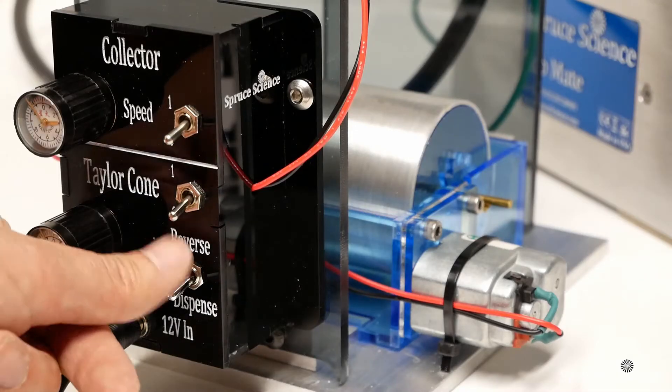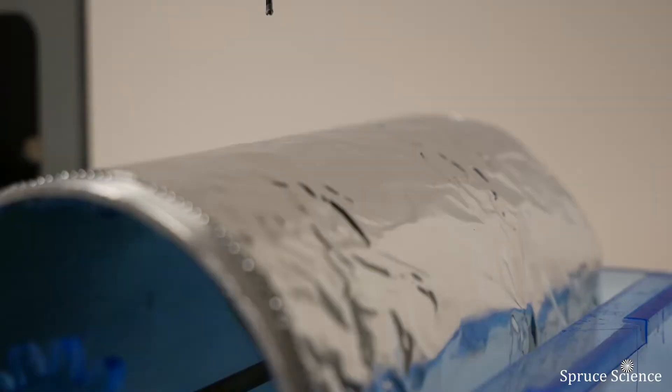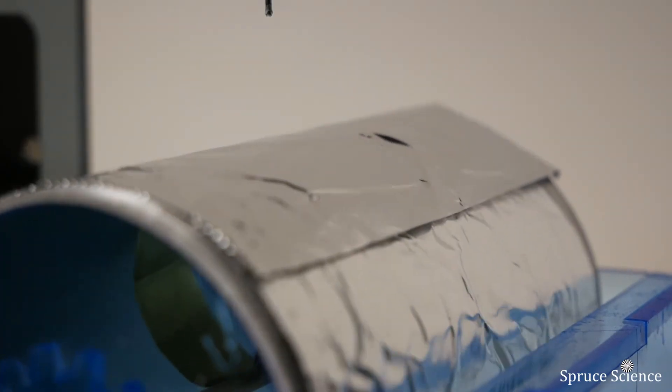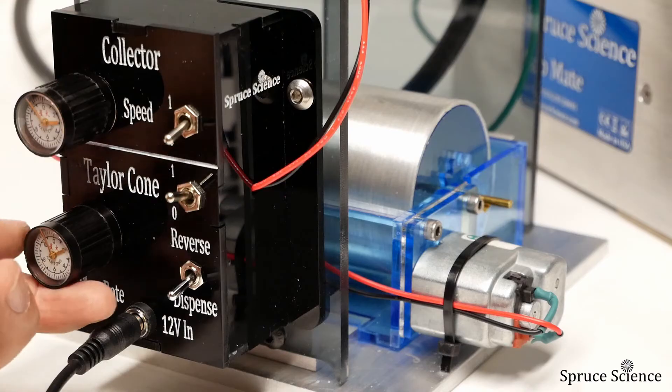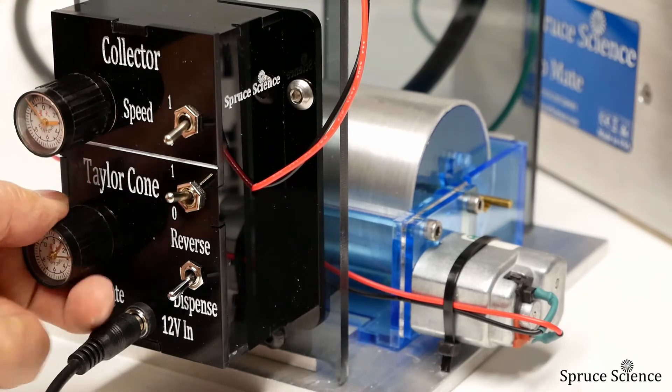Set the pump direction to dispense and turn on the pump. When the pusher inside the white tube is engaged with the syringe plunger, liquid droplets will form at the tip of the needle. This pump speed can be adjusted using the potentiometer located on the control panel.